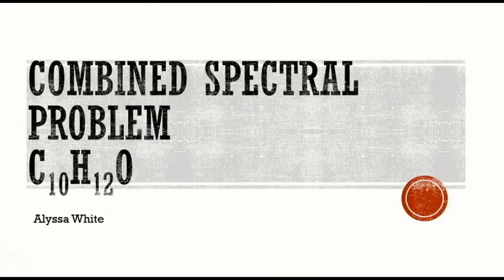All right, so here we're going to be talking about a combined spectral problem for C10H12O.